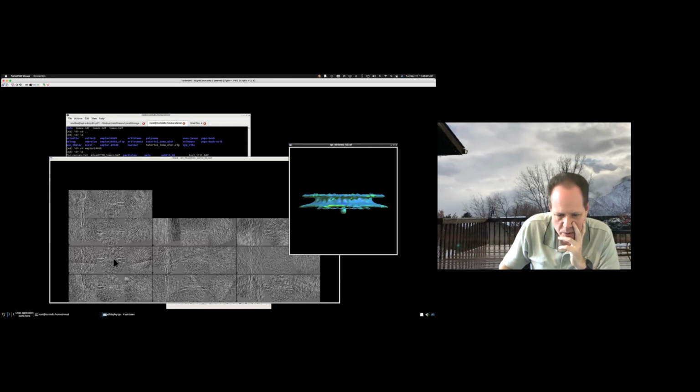You can't really see much of the protein density here until you've done the average. And what you'll see is that some of these, like this one, what's going on here? You've got the parallel membrane coming in here, but now this one's kind of all the way up here. This one looks kind of okay, this one looks kind of okay, but you can get a feel for what's going on in your data set. How about this one, right?